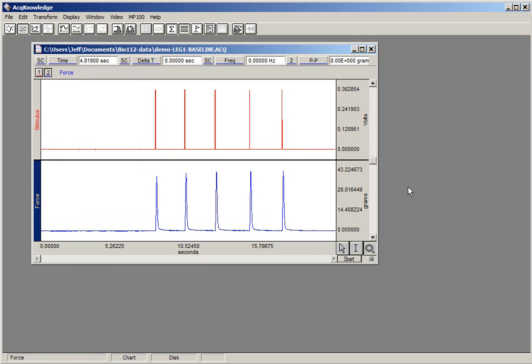Alright, the first thing we want to do is pick the three myograms we're going to analyze. How about Huey, Dewey, and Louie here? In order to analyze these, we have to zoom in close. So we go down into the right hand corner and click on the magnifying glass icon, which allows us to hold down our left button and draw a box around the myogram. I'm just doing the force side of it.